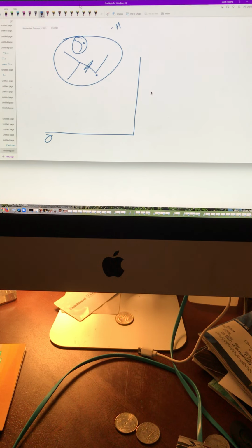So does everybody understand? What do I want you to know about mass spec? First, it uses electrons to split the molecule. Second, all those lines are fragments, called m/z ratios, and m/z is just the mass of the fragment. You could add up your fragments and figure out the exact molecule, but that's hard as hell. The biggest thing it tells you is molecular weight, which is the peak furthest from zero. And then you need to know the base peak is the tallest one.